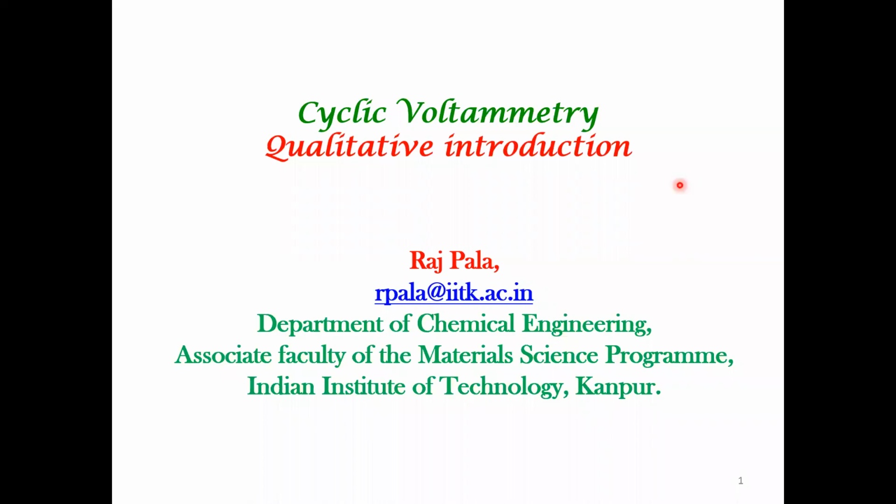Welcome back. This is the first lecture of the two lectures on cyclic voltammetry. Cyclic voltammetry is perhaps the most common electrochemical technique. Every experimental lab does it. Every theorist should know how to interpret, at least qualitatively, these experimental results. So if you want to add electrochemistry to your resume, you should know the CV.